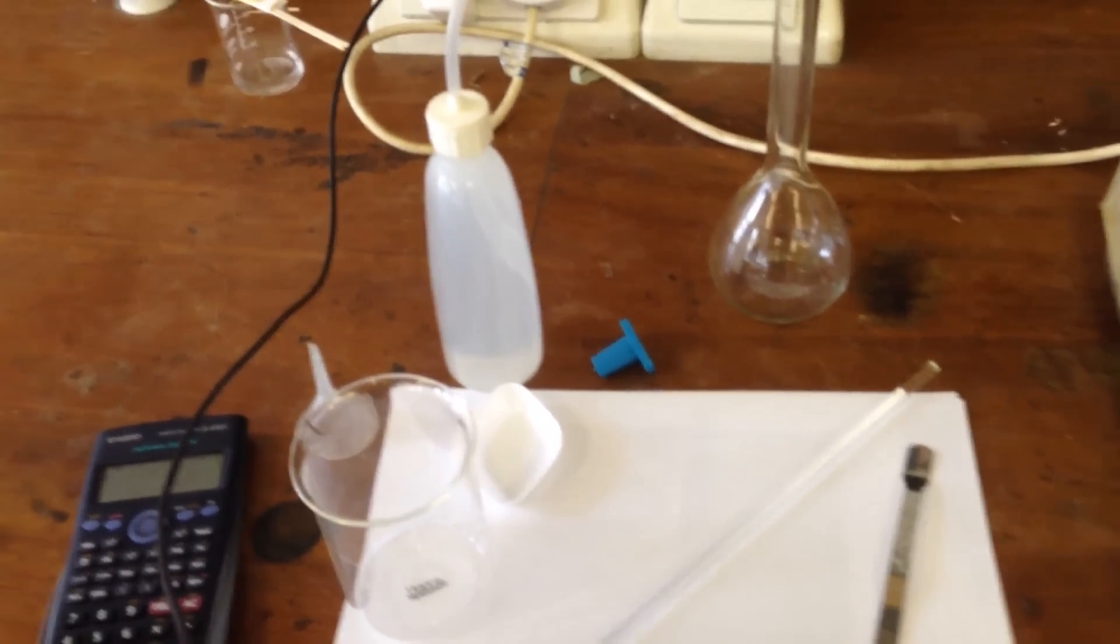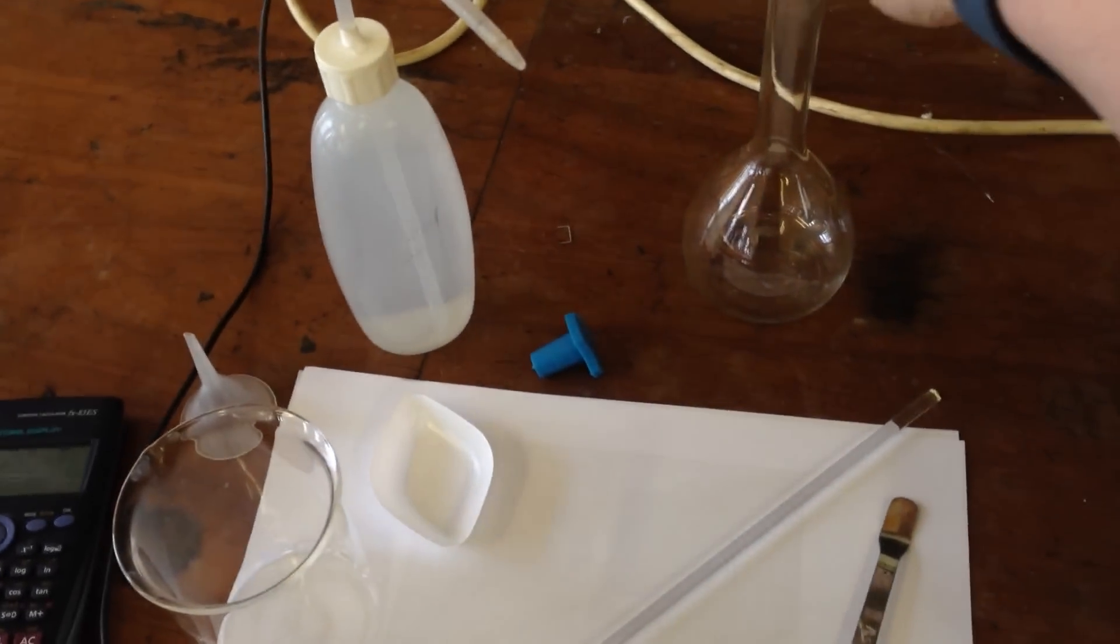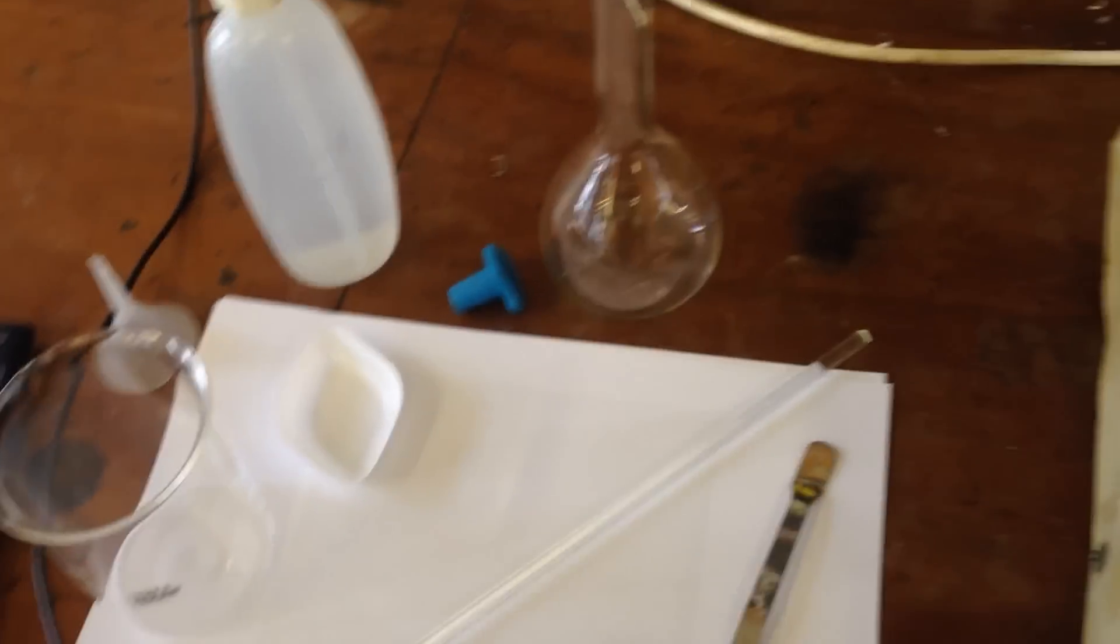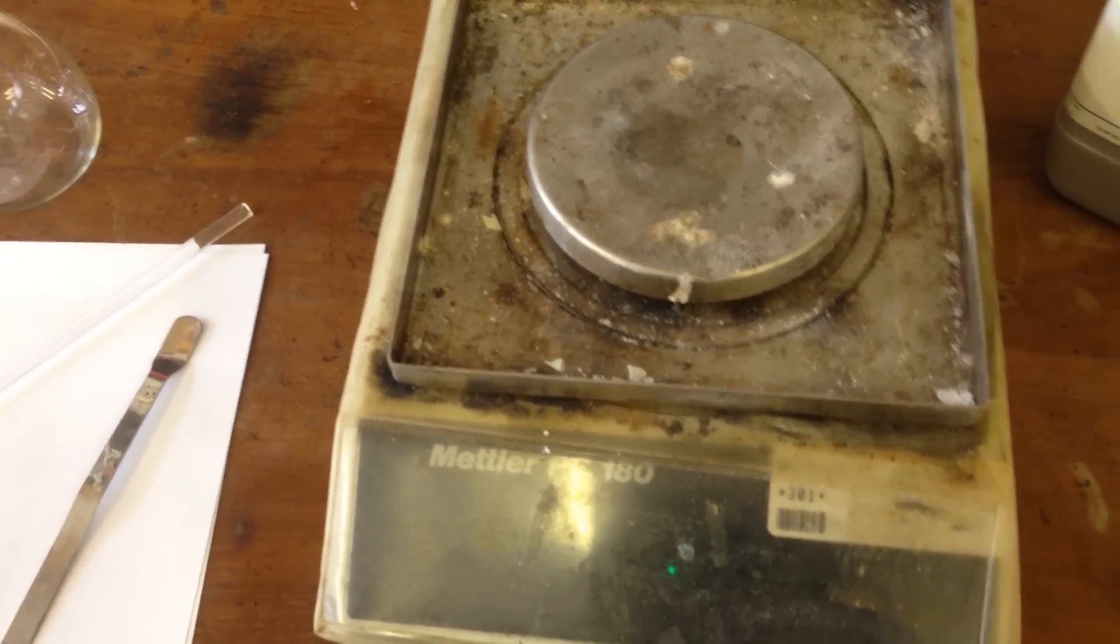In this video for O-level chemistry, I'm going to be showing you how to make a standard solution. We need a beaker, a weigh boat, a funnel, a squeezy bottle of deionized water, a volumetric flask, a stopper, and we need a balance that is very accurate.